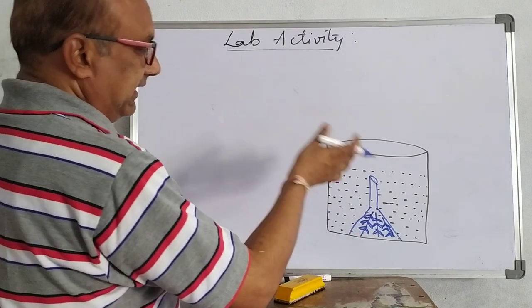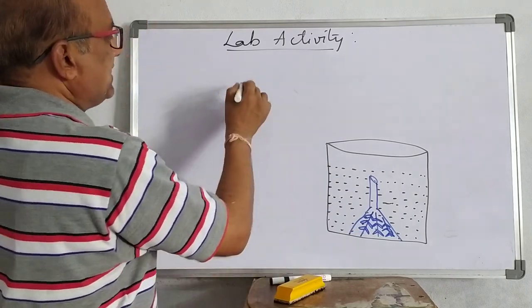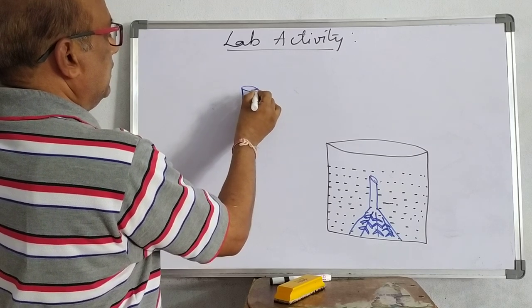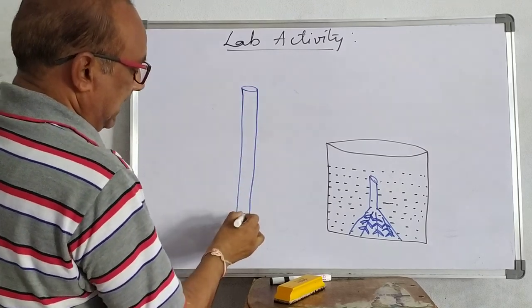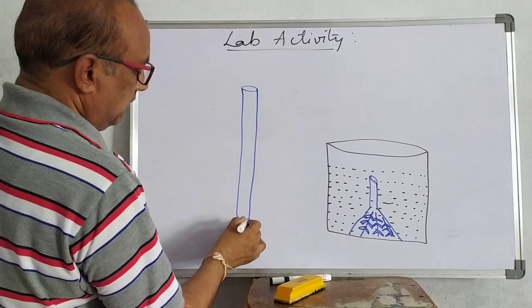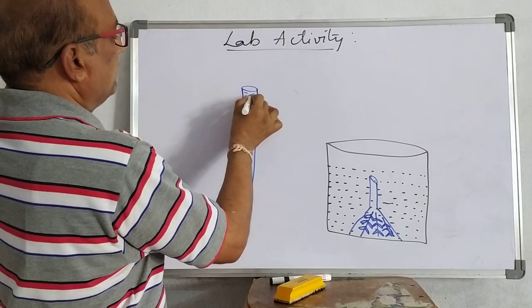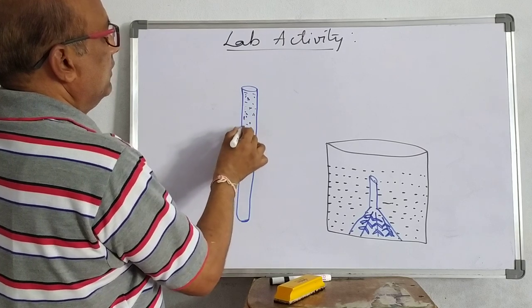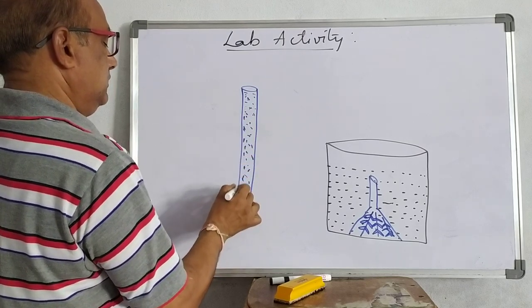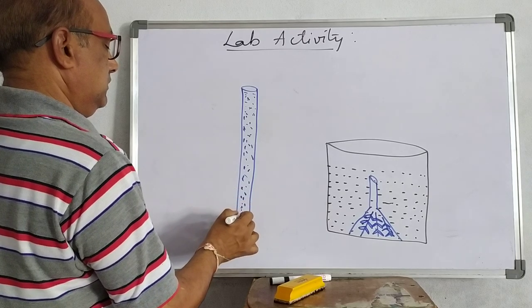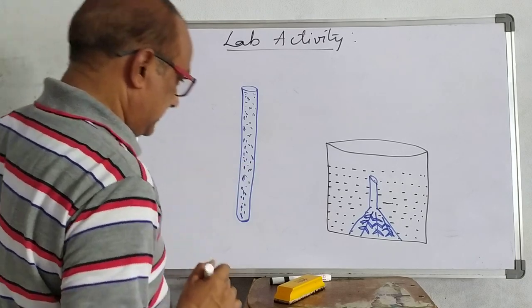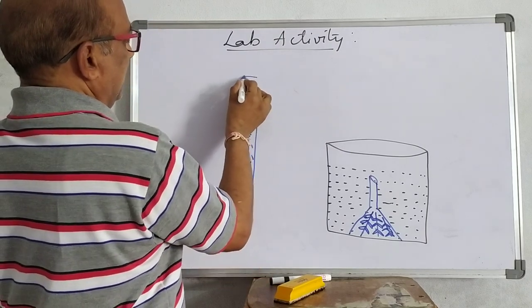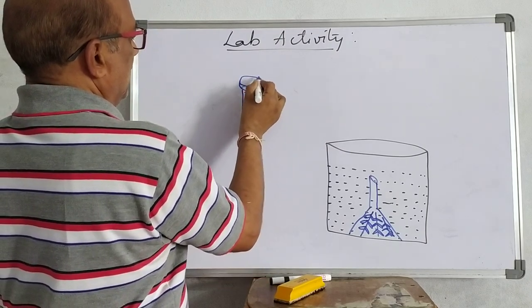Then beside this, take one test tube containing water like this, and insert by closing it with a thumb.